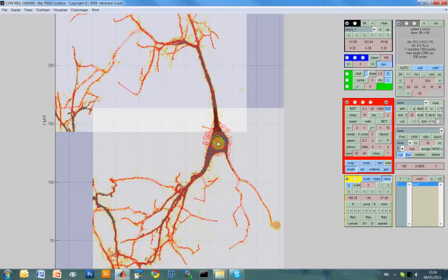the root of the reconstruction. In this case the parameters were a little bit too large again, so I can undo and then set these a little bit smaller. I don't know, 30 maybe. Okay, I can play around with that, maybe 35. And undo, and then voila.